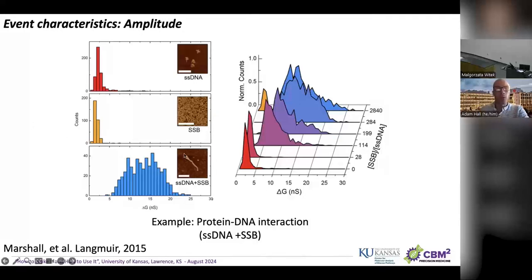And when that happens, you end up with a molecule that's much, much thicker. This is an AFM example of what that looks like. It's stretched out and it's now much, much stiffer and thicker. And when you translocate that through a nanopore, you get a very different signal, a very different amplitude, because this is so much larger. You're actually looking at the diameter on the way through.